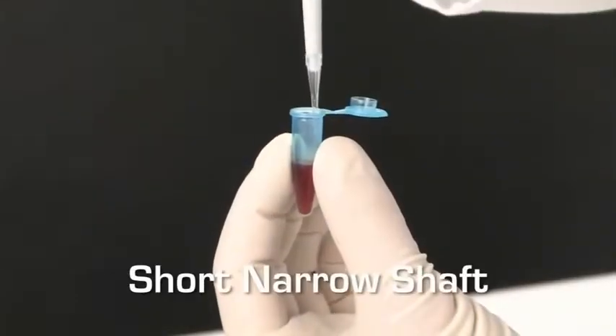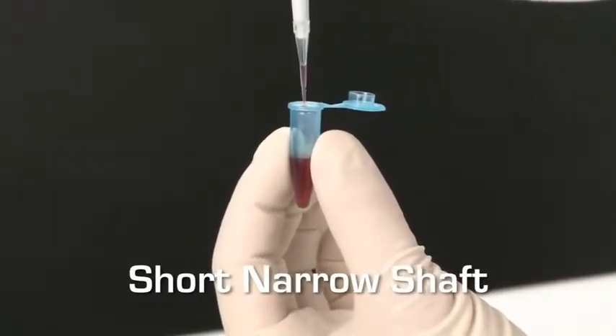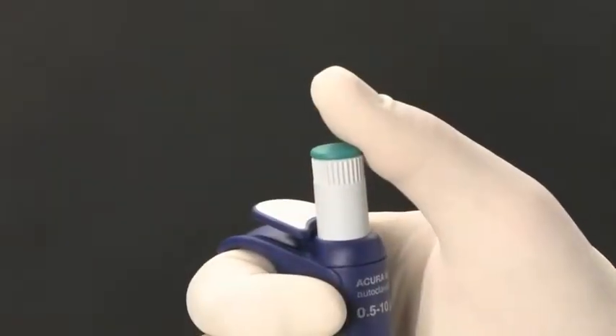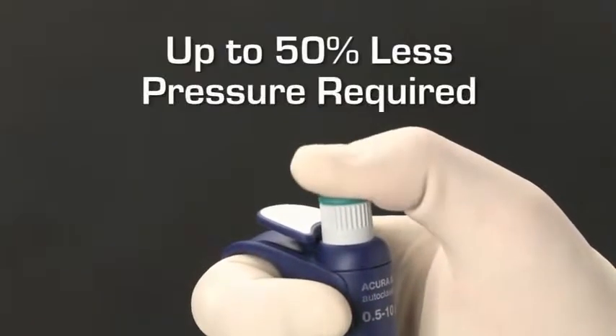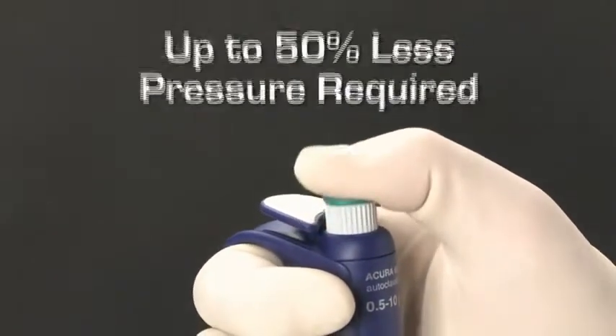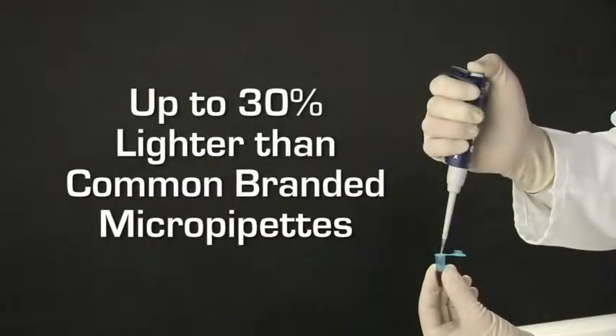The short, narrow shaft enables dispensing into the tighter opening of smaller microtubes without contaminating the procedure. A newly designed plunger seal provides extremely smooth, stable action to maintain steady handling while dispensing and to further reduce hand fatigue. The reduced weight makes it effortless to control while performing delicate tasks.